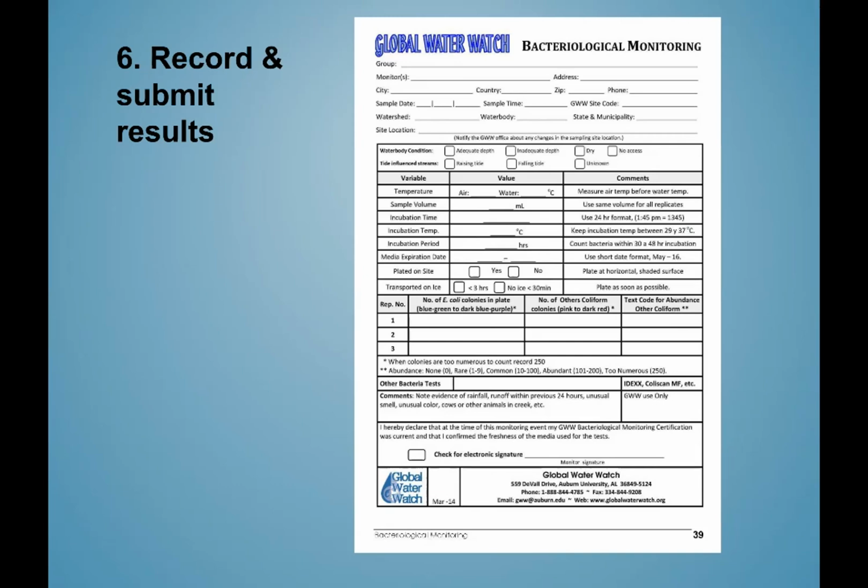I have a question. Sure. If you've taken your media and frozen it before its expiration date, but then you're using it from the freezer after the expiration date, do you note that? No, it's supposed to be stored frozen. So even if you've been storing it frozen, if it's past the expiration date, you can't use it. Oh, okay.